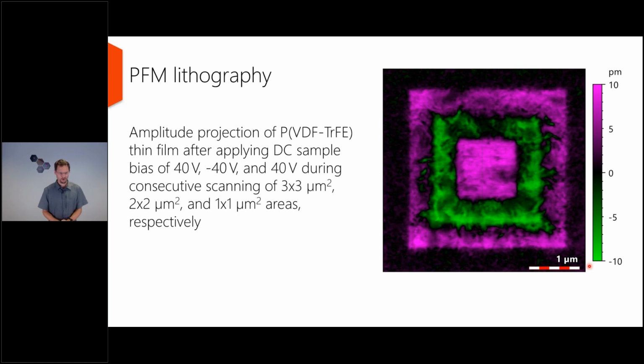4 micrometer image again, and outside you see the sample is not activated. I have a very low amplitude, the dark color. This is again a projection image, and you see there the positive polarization, the negative and the positive. What you nicely also see is that the domains of the negatively polarized grains go nicely into the positive ones.